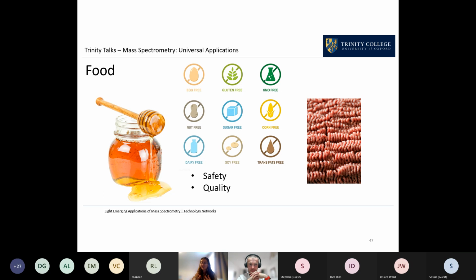And that is, again, just you would take a sample of beef first, take a sample of horse, and then you'd test your mints and say, well, does it look like the one on the left, or does the mass spectrum look like the one on the right? Or is it a mixture of the two? And so from that, you can identify what molecules are present in this meat, and therefore what is it likely to be made of.